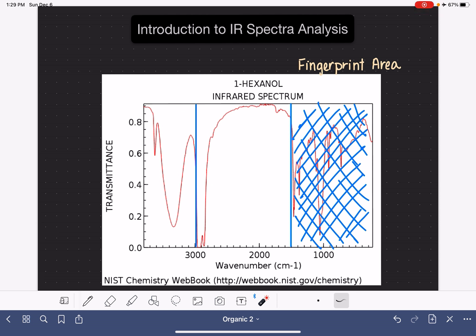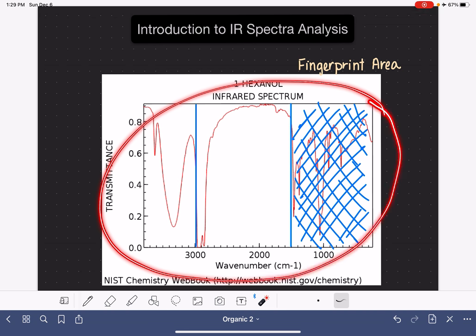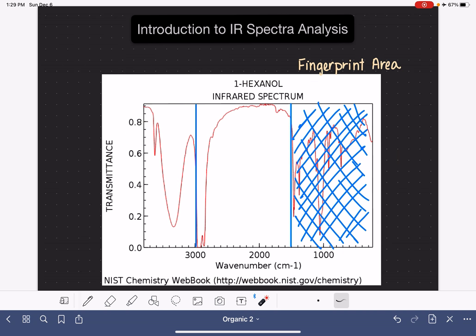I do want to say, as a side note, if you are matching spectra, so let's say you have this particular spectrum right here that you're looking at and you're trying to match it to a reference, then typically in that situation, we do want to focus on the fingerprint area and match the fingerprint areas of a spectrum to a reference spectrum. That matching process, we do rely heavily on fingerprint.